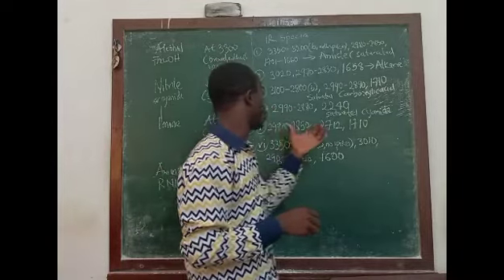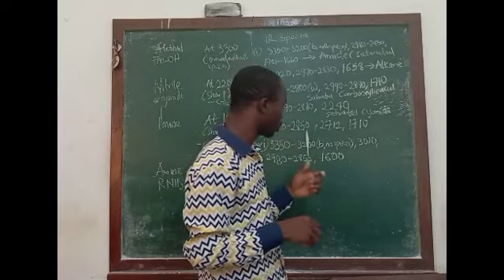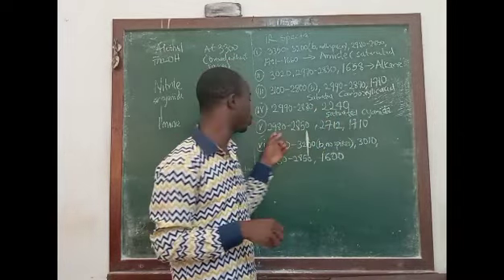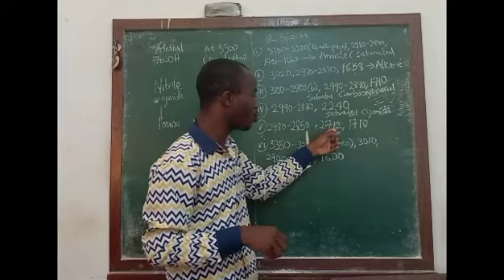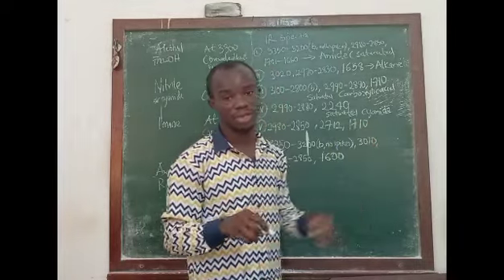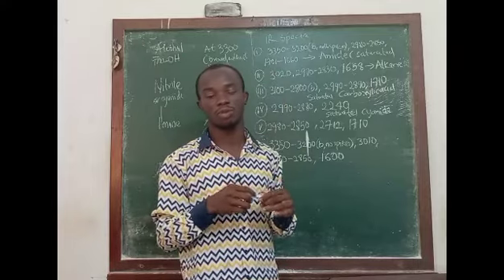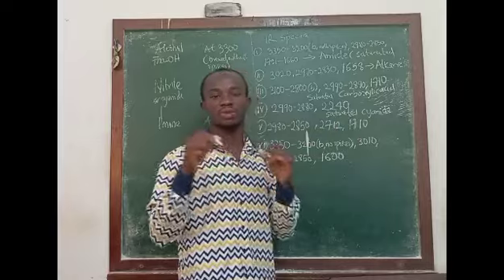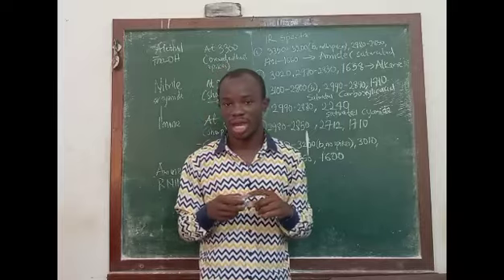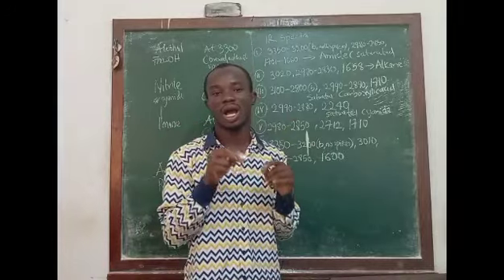A saturated cyanide compound, because we have a signal for C triple bond N and a signal just below 3000. Now, the next spectrum, the fifth one, gives us three different signals. We have one just below 3000 between 2980 and 2850, one at 2712, and one at 1710. The signal at 1710 already tells us the spectrum is for a carbonyl compound. But which kind of carbonyl compound does this represent? I said specifically that aldehydes usually have a diagnostic signal at 2700 and 2800.